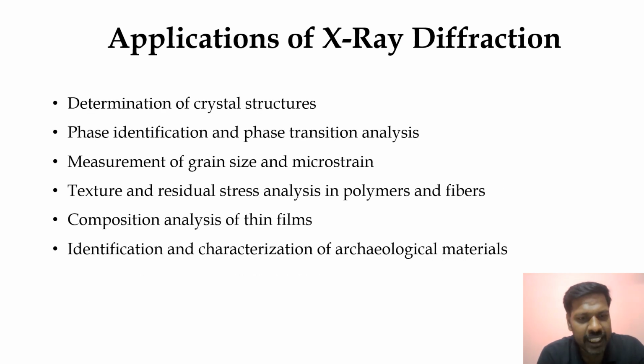XRD has many applications such as determining crystal structure, identifying unknown phases, measuring grain size and strain, studying polymers and fibers, analyzing thin films, and studying archaeological material. XRD is widely used in both research and industry.